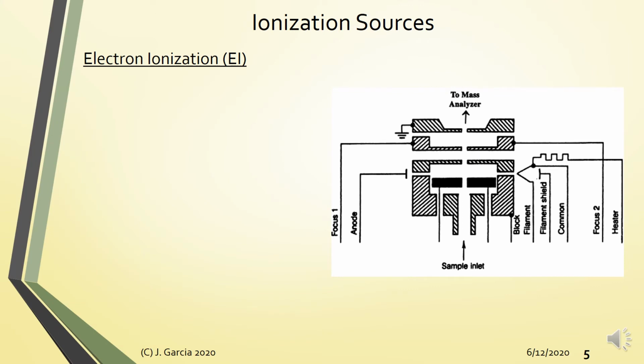So next, you have your ionization sources. So for molecular mass spectrometry, this is the part of the instrument that converts your molecule into different fragments, molecular ions. Alright, so there are many types of ionization sources. Okay, may advantages and disadvantages ng bawat isa. And some ionization sources are chosen depending on the type of analyte being analyzed. So some of the examples of ionization sources.